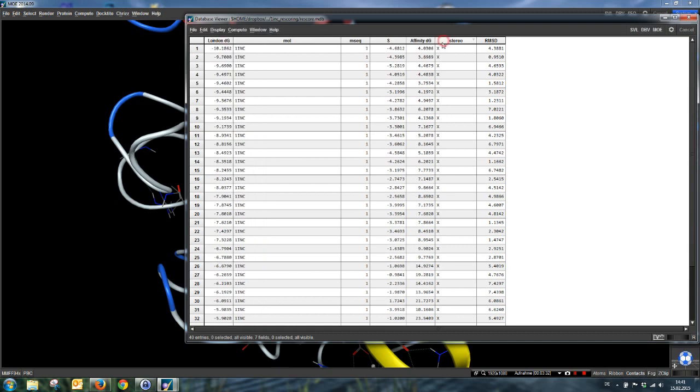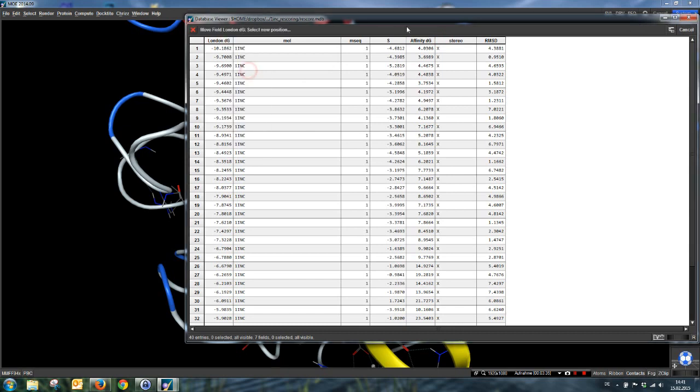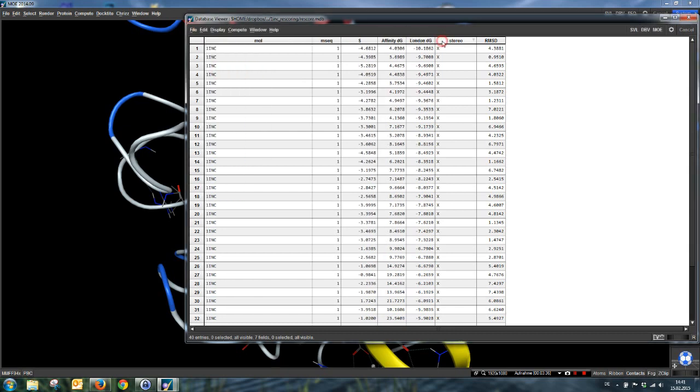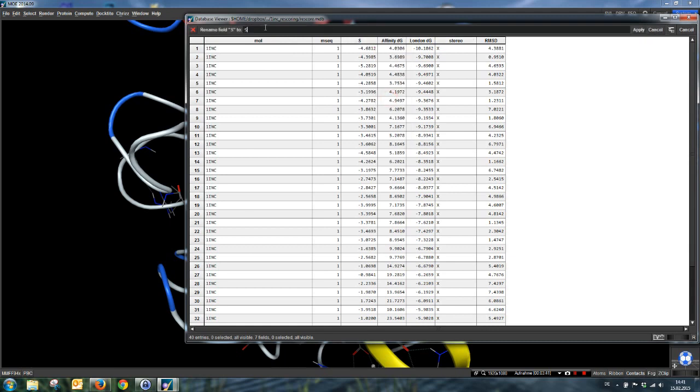We can now tidy up the database, move the scores together, and we can rename this score as affinity from docking.